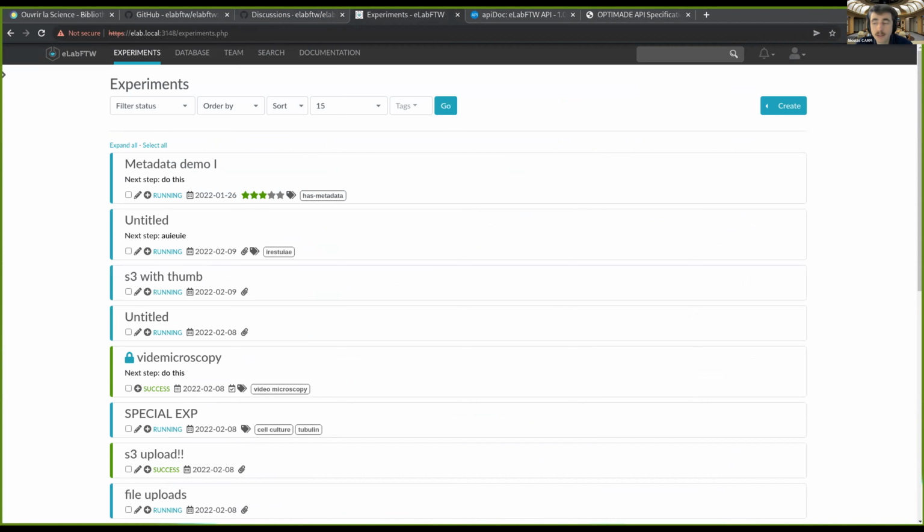When you generate a gigabyte of data, where do you store it, in a place where you can find the corresponding experiment in your lab notebook, and how do you link both together, knowing that sometimes the server will move, and that once you have published your paper, you want this data to be available.